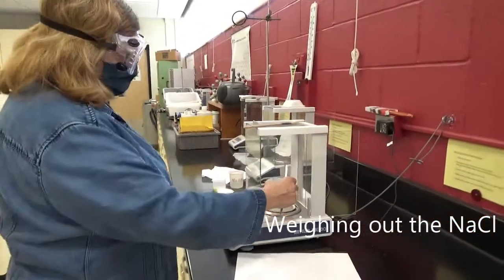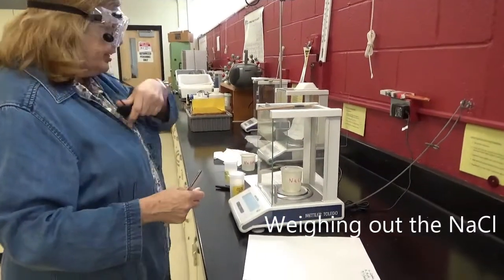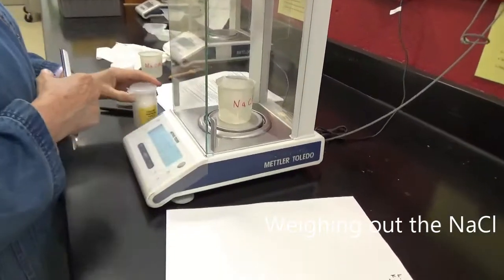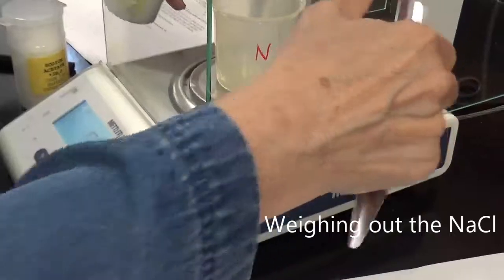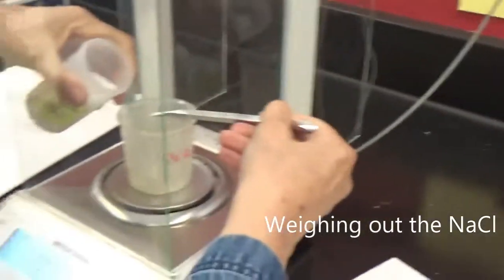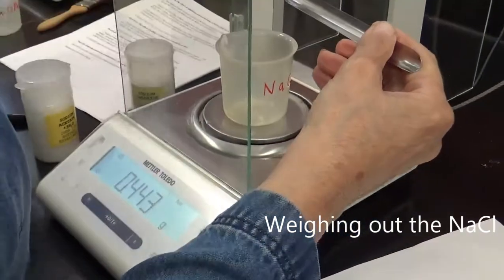So first I'm just going to tare my beaker. And the instructions say to weigh out about 0.29 grams. Oops, it's already too much.